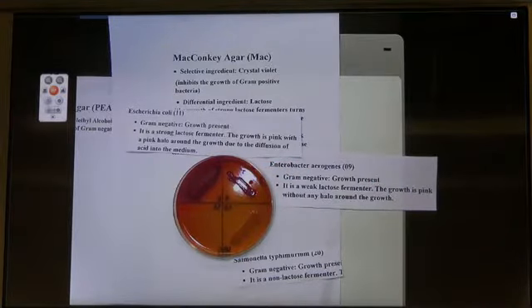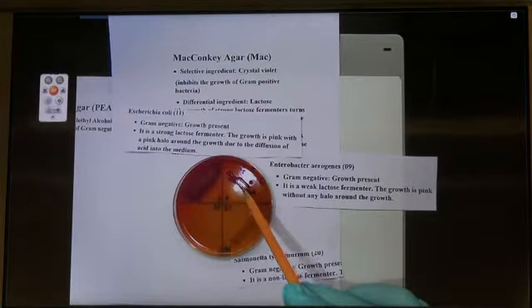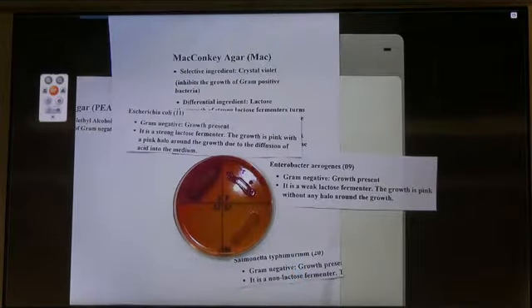What color is the medium? Both are pink. Outside the medium is pink. Here, medium, no change. But in number 11, it changed. Number 20, no change in the medium. Yep. No change. We are going to look at the chart now.